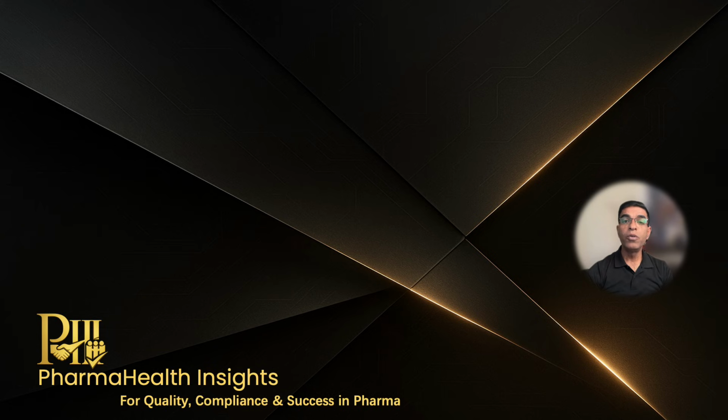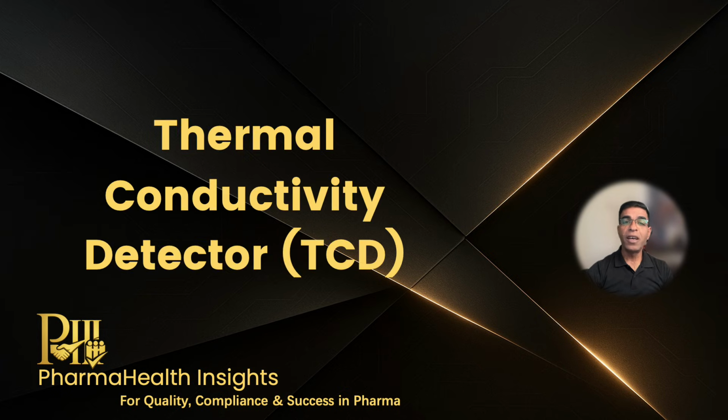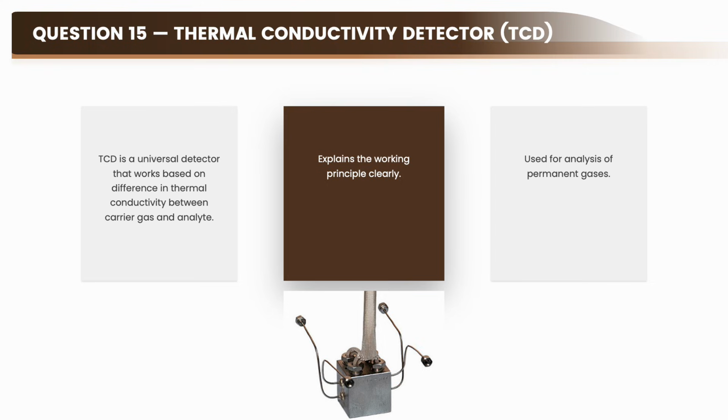Now, the discussion will move towards performance parameters, troubleshooting concepts, and advanced GC applications. So be ready for it, and that is exactly what we will cover next. What is TCD detector in gas chromatography? You should answer like this.